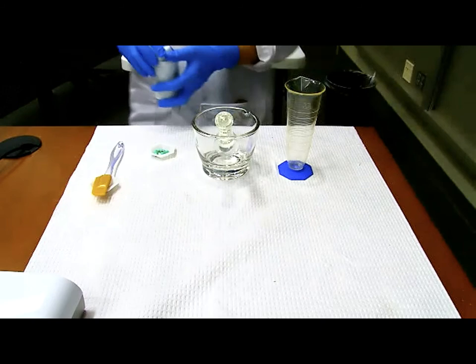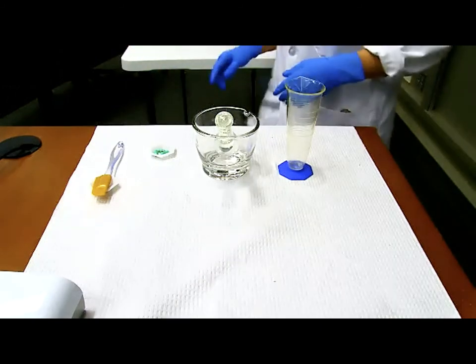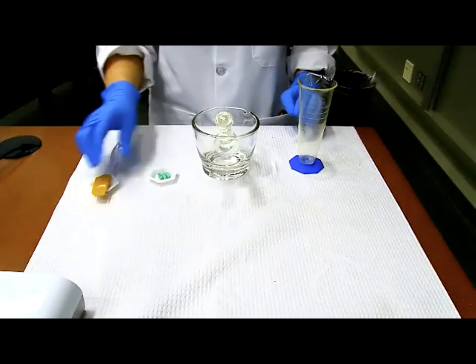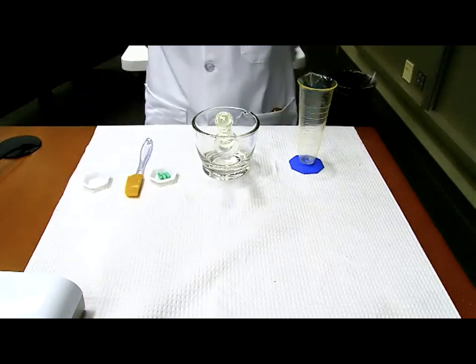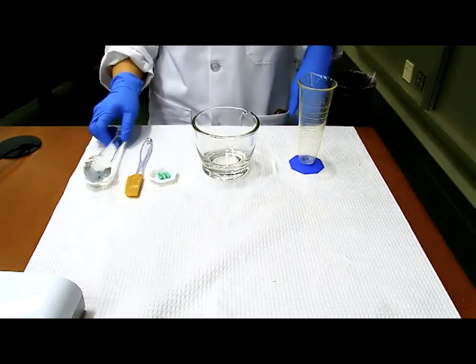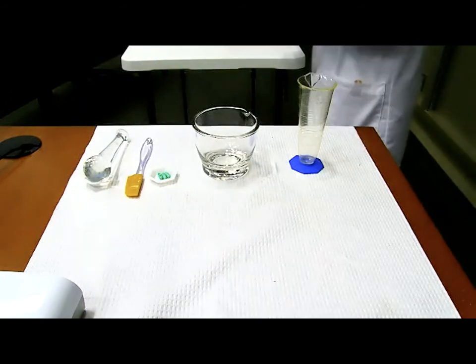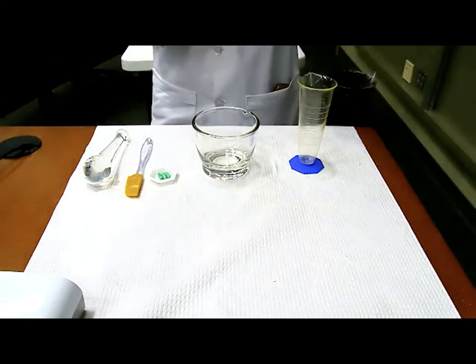Now, in this excess method, remember, step 4 is important. It says add the remaining amount of Ora Blend to the mortar, meaning that the entire volume is added to the mortar. Everything is compounded in the mortar before step 5, which says to then transfer the volume to dispense. So I'm just trying to re-emphasize those are 3 key things for the excess method to be aware of. Okay, so with that, Judy, tell us how to do it.